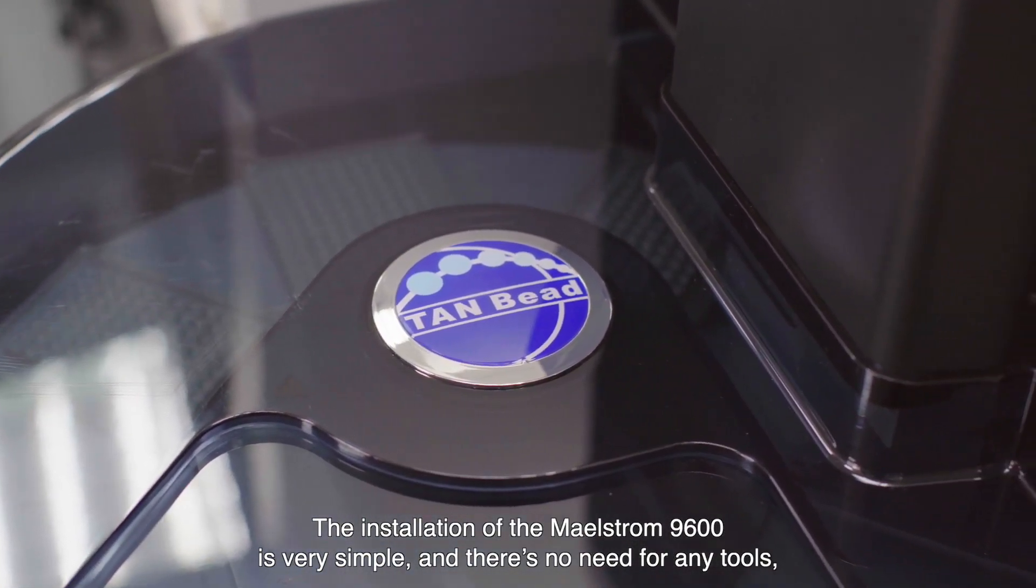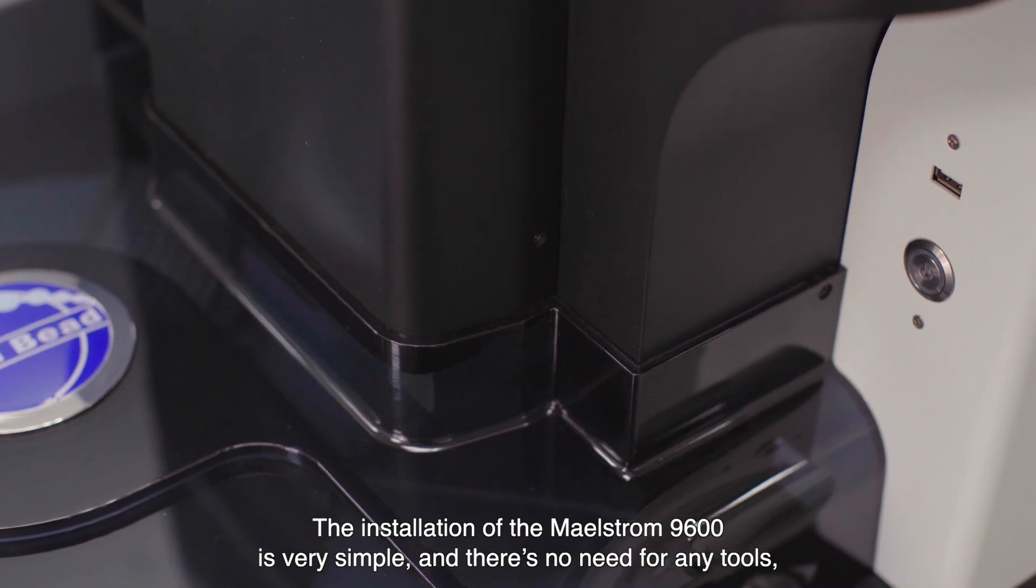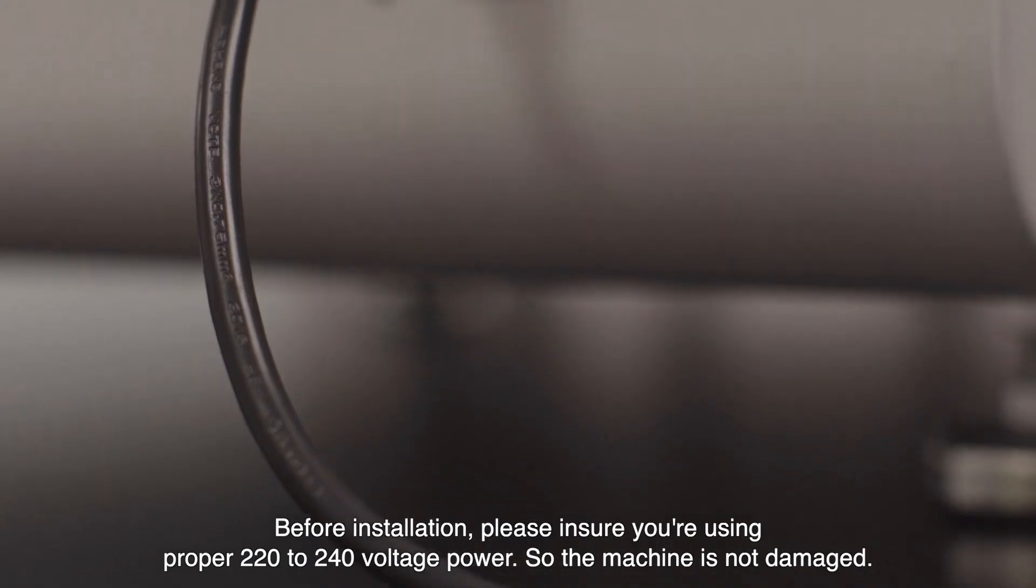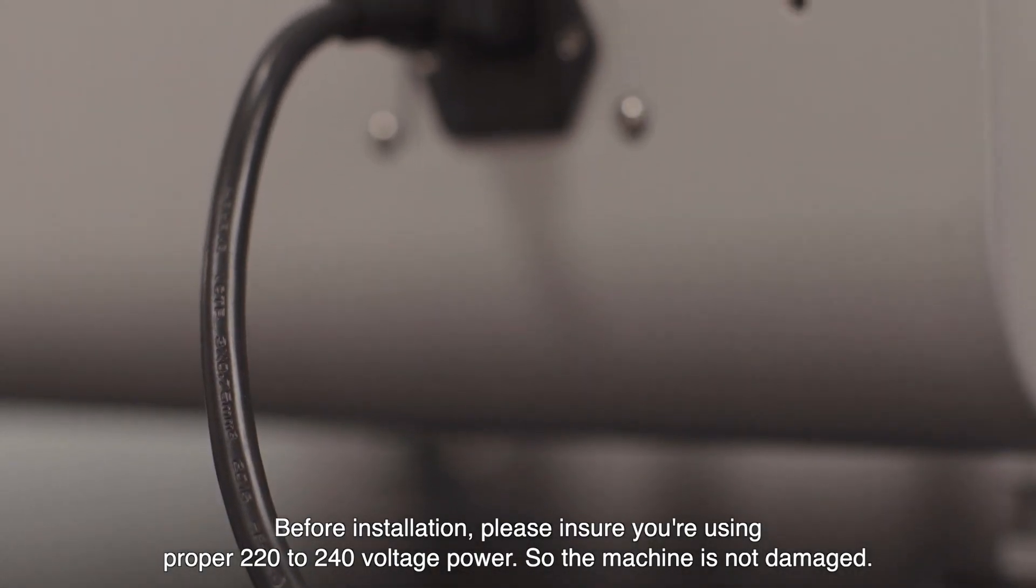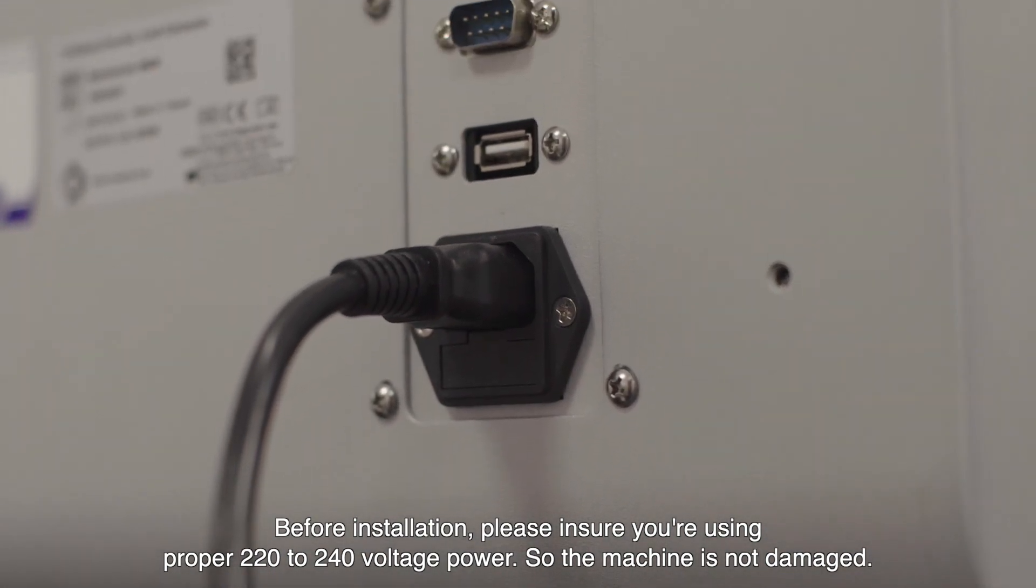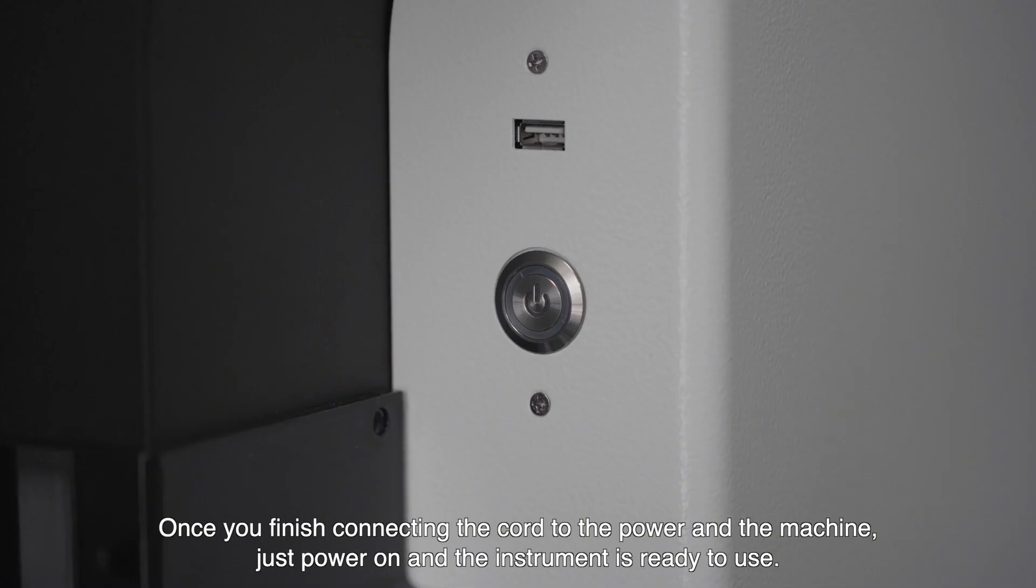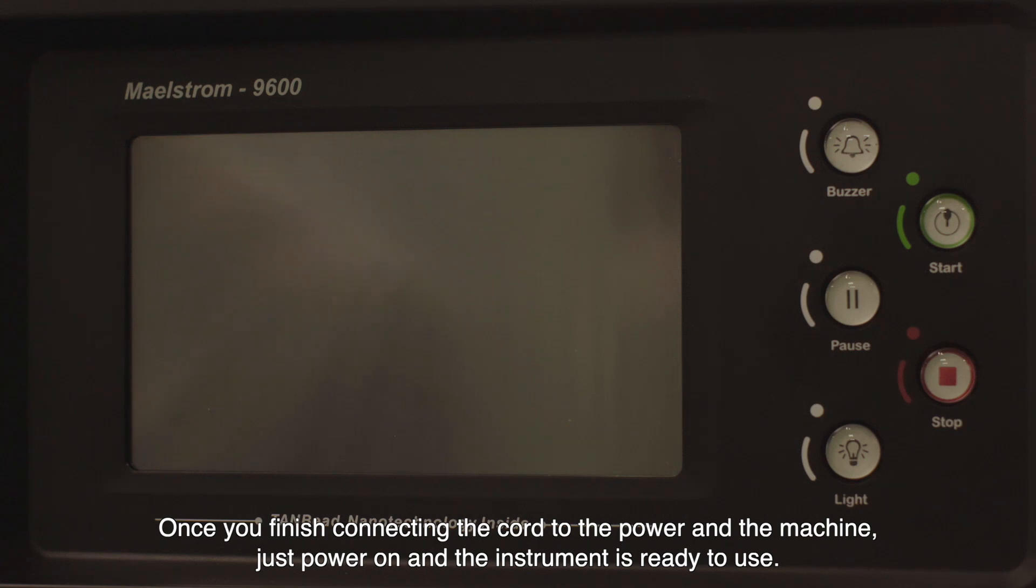The installation of the Maelstrom 9600 is very simple and there is no need for any tools. Before installation, please ensure you are using proper 220 to 240 voltage power so that the machine is not damaged. Once you finish connecting the cord to the power and the machine, just power on and the instrument is ready to use.